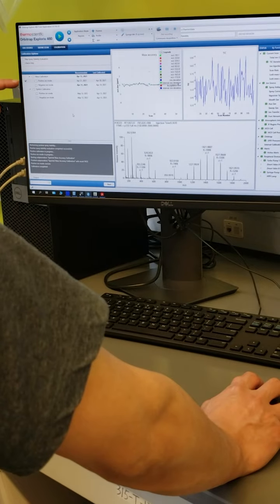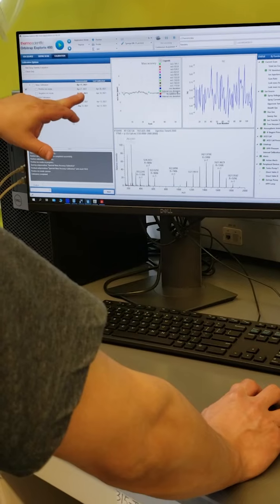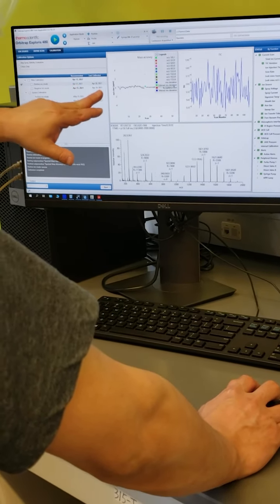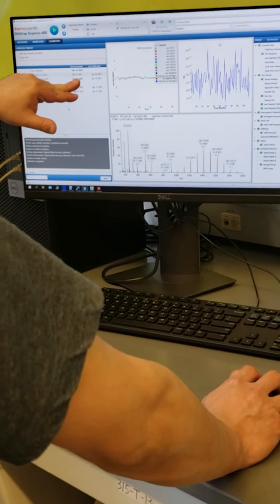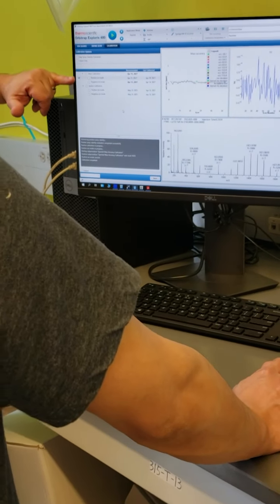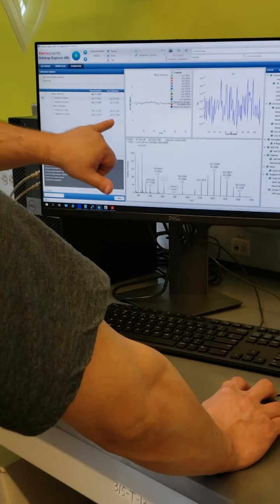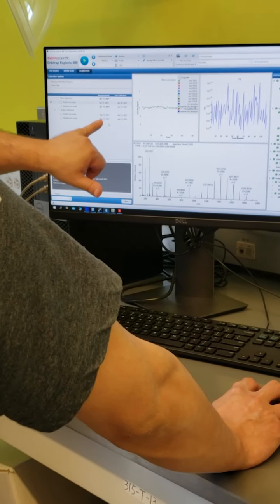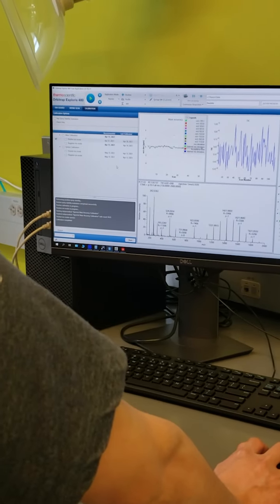The other option: we did this, and it's saying it's calibrated April 20th. Recommended, it's always going to put you on a daily calibration cycle with Orbitrap. Your call if you want to calibrate it daily, but they do recommend it. My recommendation is calibrate it weekly. Norm calibrated it on the 13th, and it's recommending it at 1 month for the system. But because I'm here, we're going to do it.